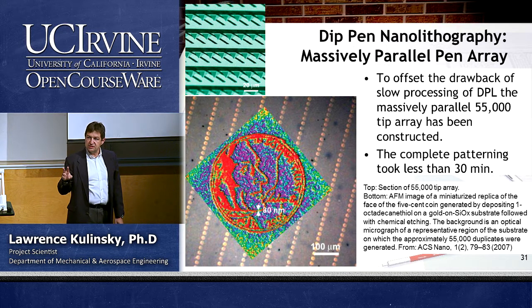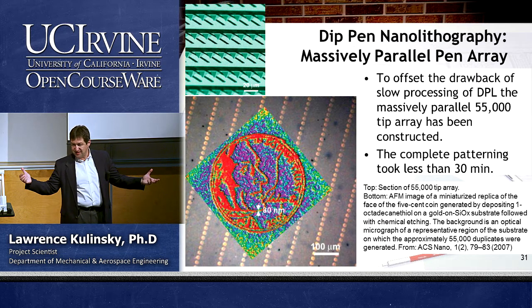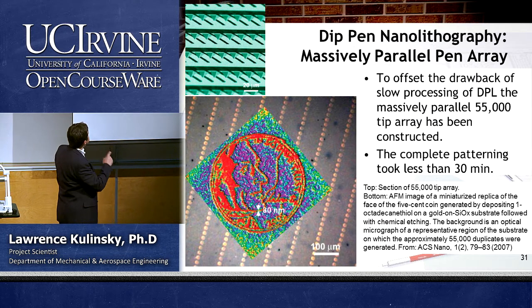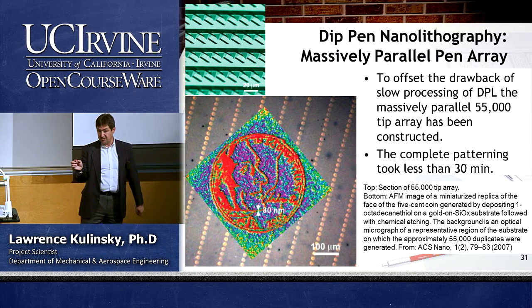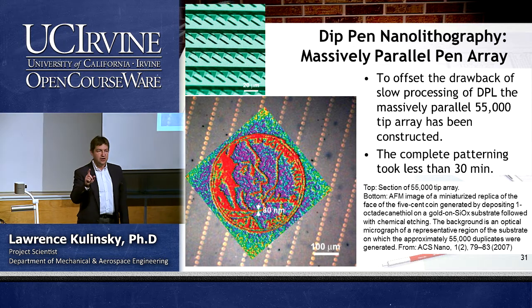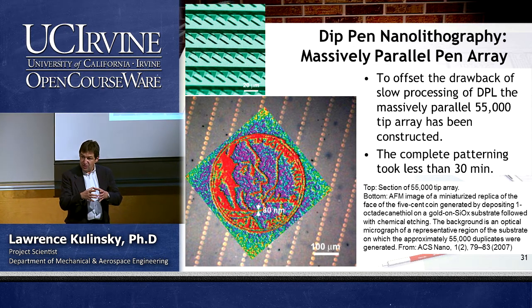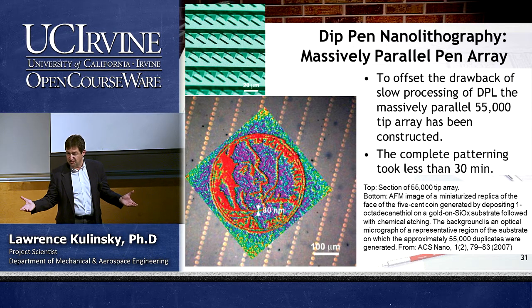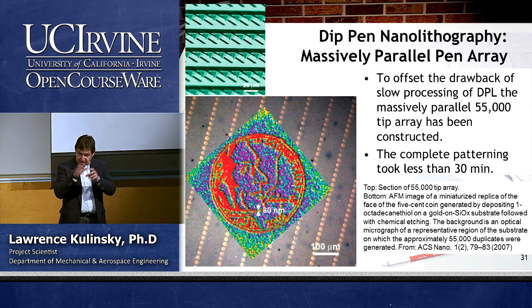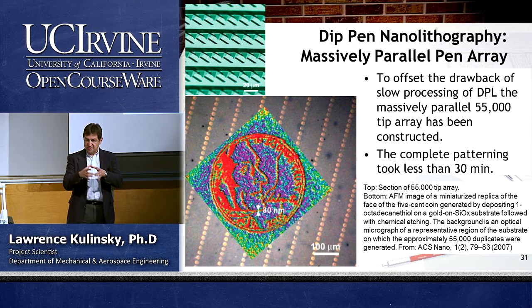But number two, you can use the same array for a long time, right? And each tip is just silicon, right? So you can very easily etch it. And the key is here, you can do them all at the same time because it's a photolithographic process. So you use the mask, right? You take the mask off, you etch it. So you can virtually have all of them done in like one day because basically it could be just one wafer.